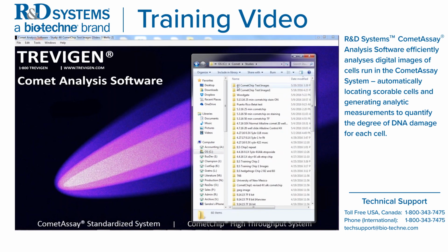But it's within these study folders that you have all your different individual experiments. So if you delete these, it's gone, and all your images are gone that you actually put in there. So one thing is always keep your images in a separate location in case you decide to delete your specific experiment. Or when these folders start to take up a lot of room, you can move the study folders into a different location. And if you need them, you can just move your experimental study back into the studies folder, which is in the Comet folder.